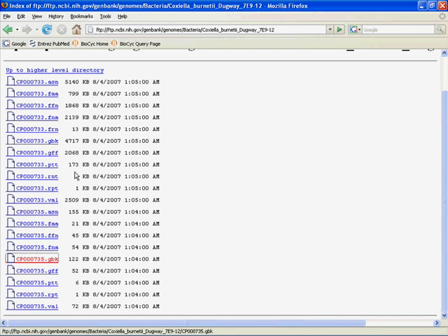Okay. So we're done downloading what we needed from NCBI. We have a GenBank and a FASTA file for both the chromosome and the one plasmid that Coxiella Burnettii, this strand anyway, contains.